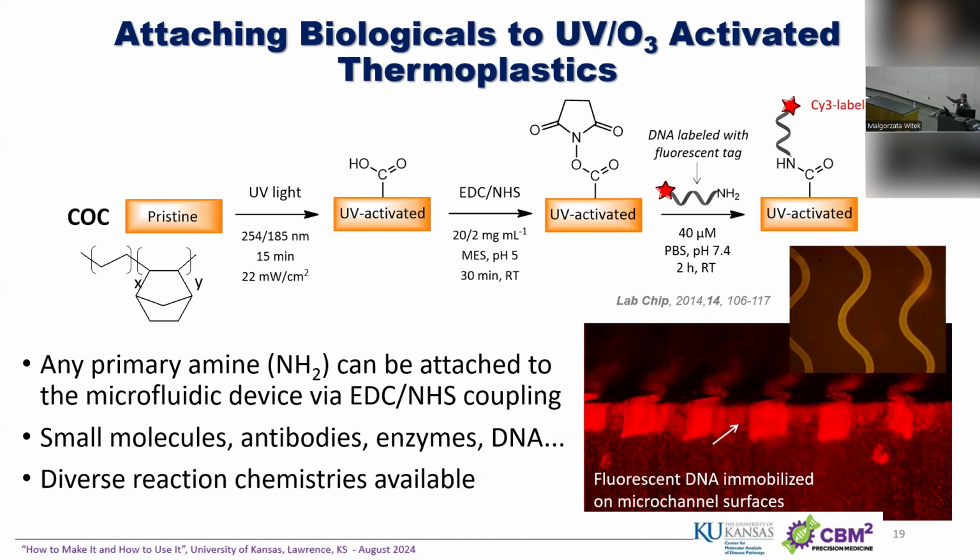And then when you bring the molecule with the lysine or primary amine, they will create a beautiful covalent attachment forming this amide bond and will not go anywhere. So you can attach oligonucleotides, you can create microarrays. This is an example of that.